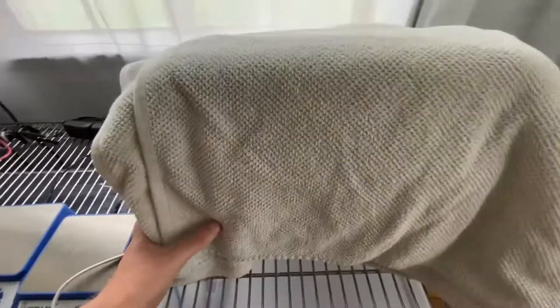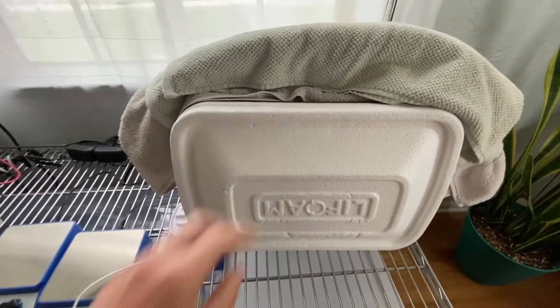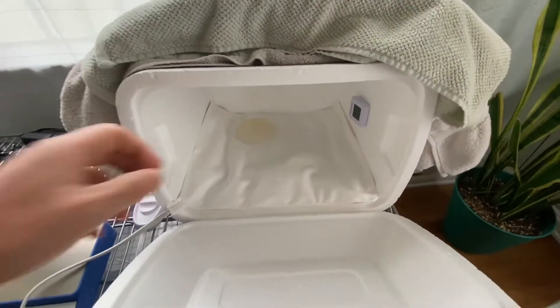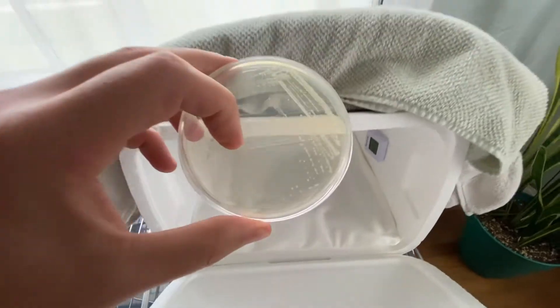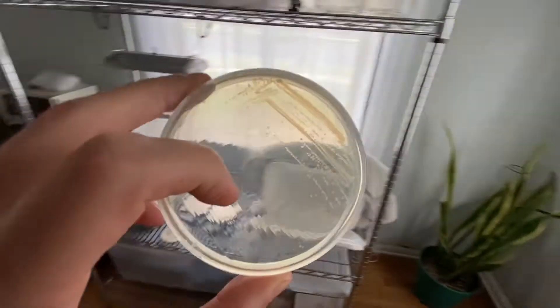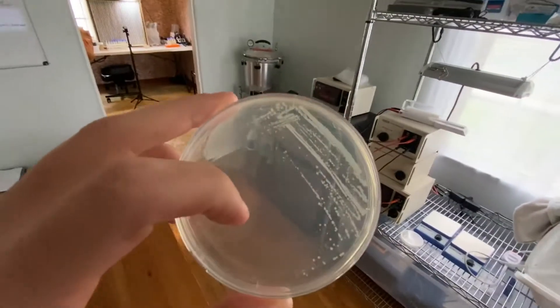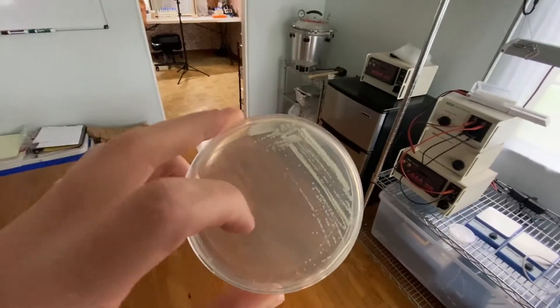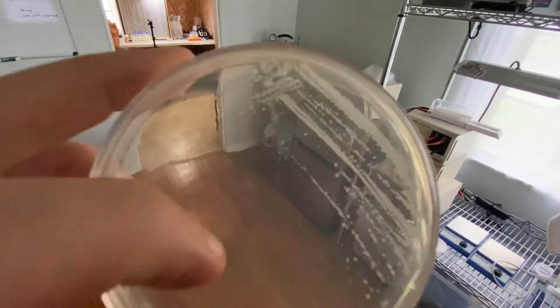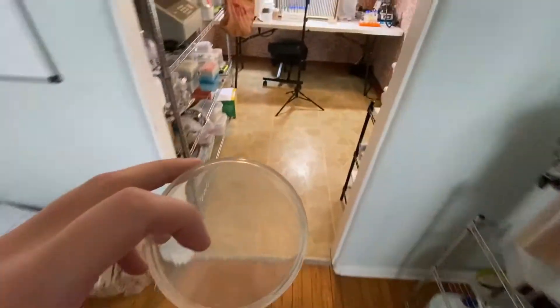I can usually tell right away if it's working because E. coli has a very particular smell. Yep — I smell E. coli. Wow, look at that! So first of all, you can store an E. coli stab for 15 or greater weeks — that's over three months — and it will survive. Look at all of those colonies growing. This is the DH5 alpha. I'm going to bring that over into the lab.